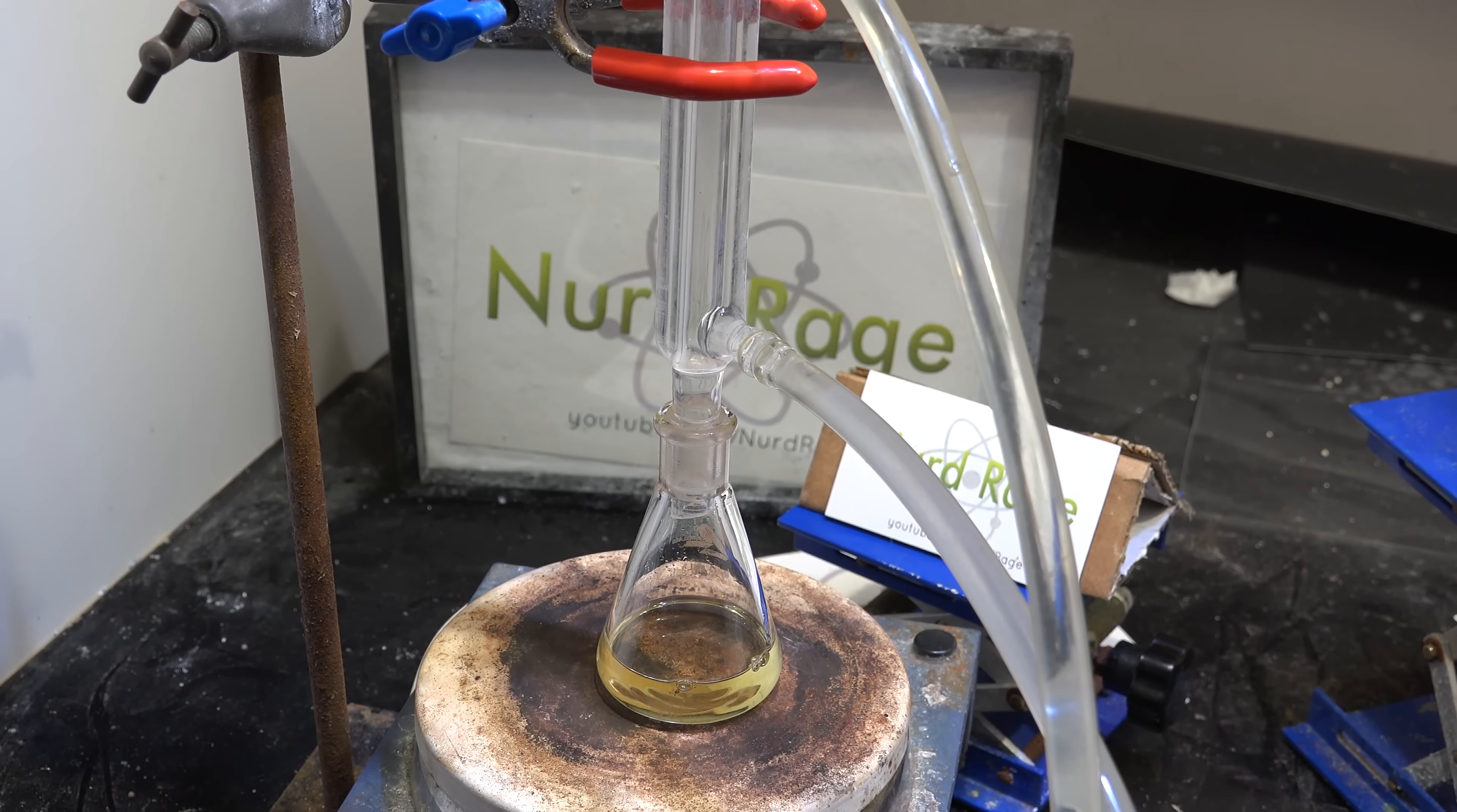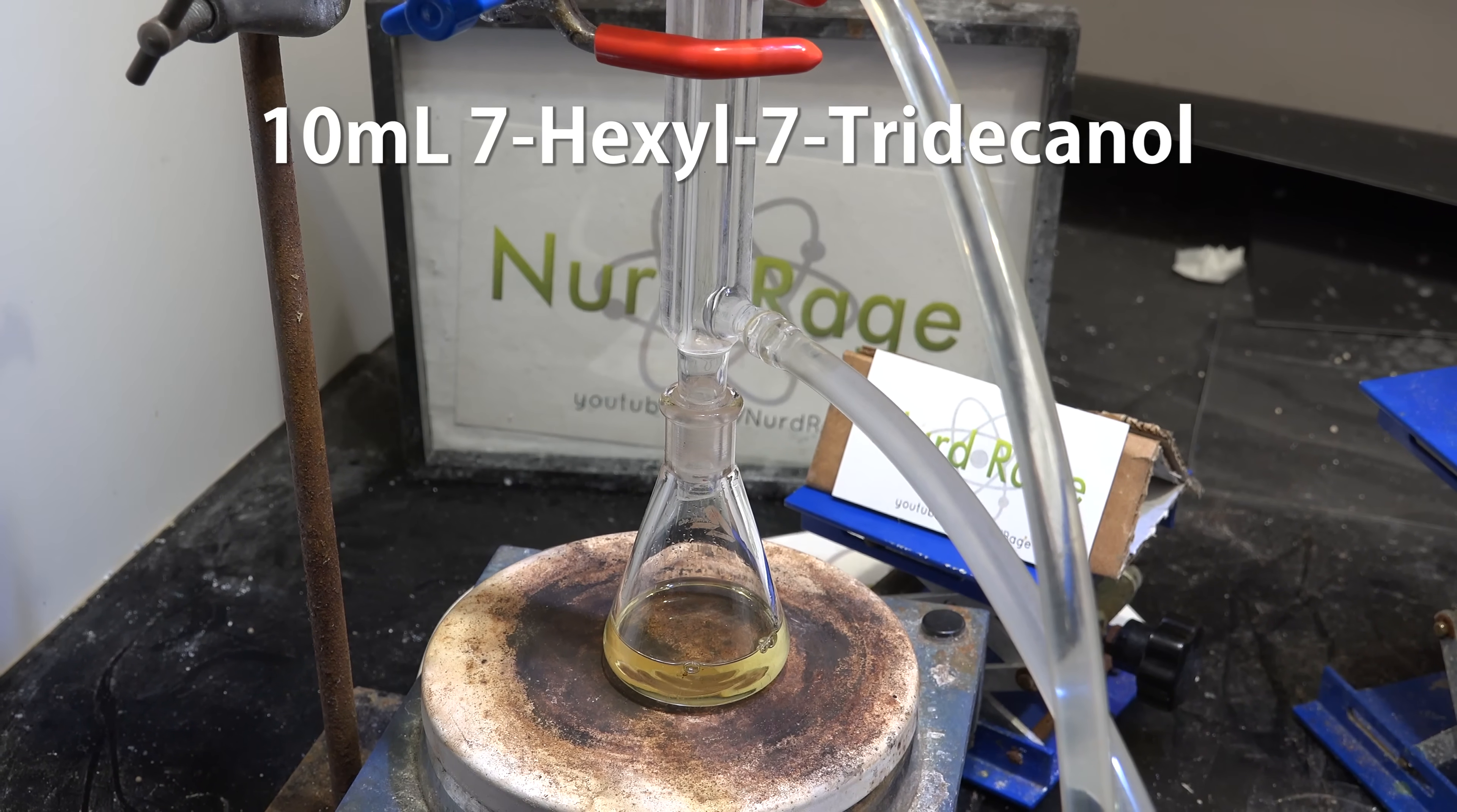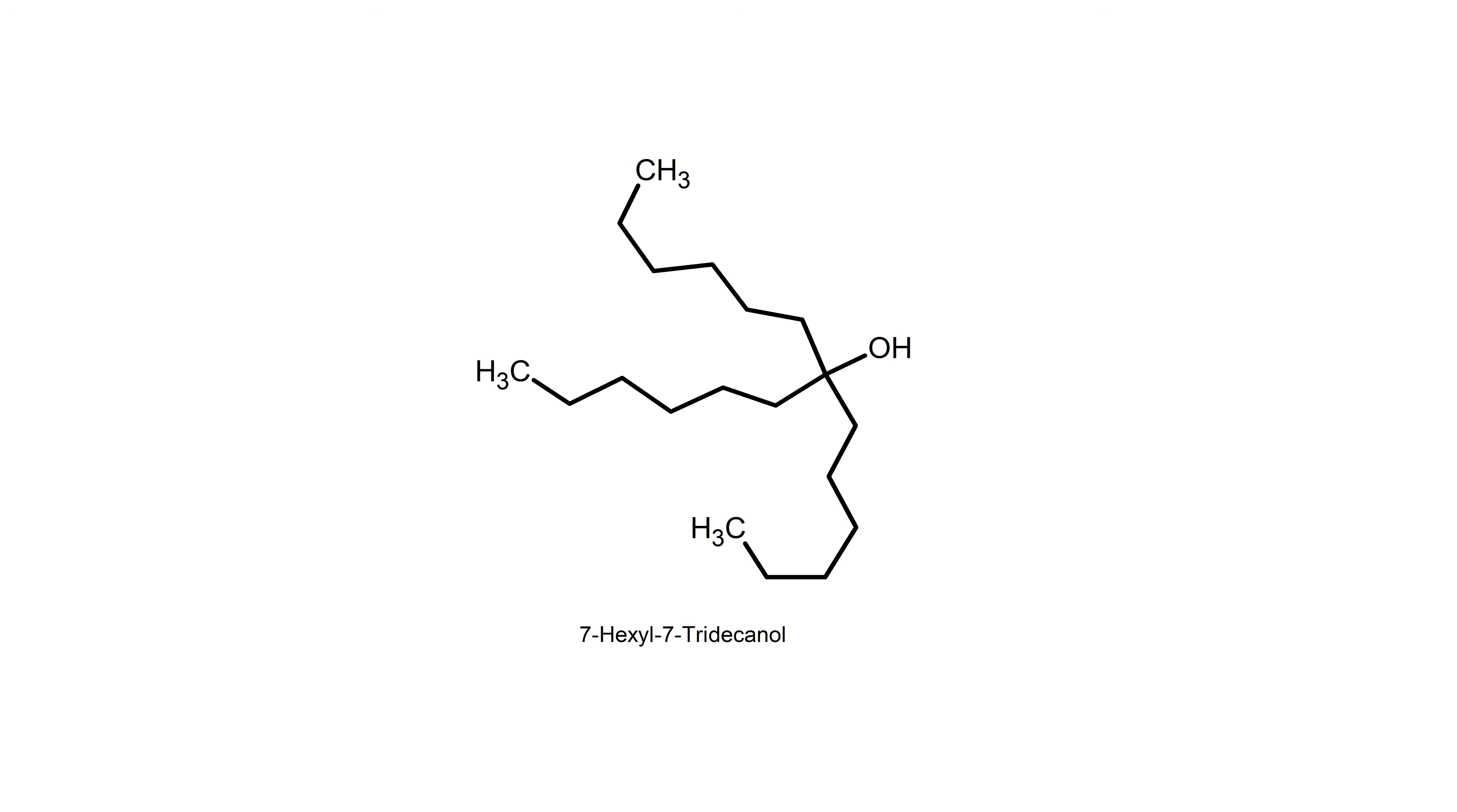So to do this we set up a condenser on a flask with 10 mL of pure 7-hexyl-7-tridecanol. This is a super heavy alcohol that I engineered specifically because it would be the ideal alcohol for this experiment. It's a tertiary alcohol catalyst but at the same time it's so large that it can also serve as a solvent.